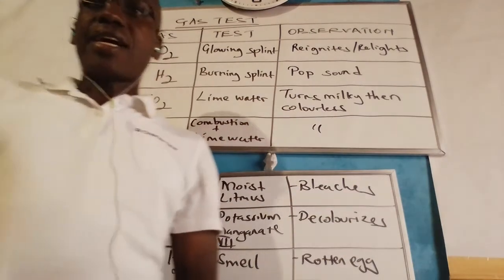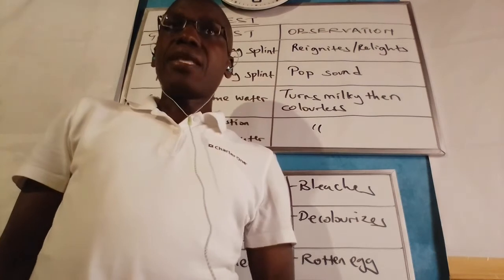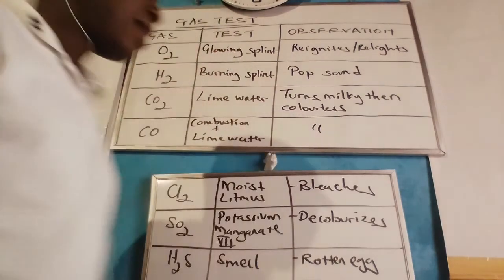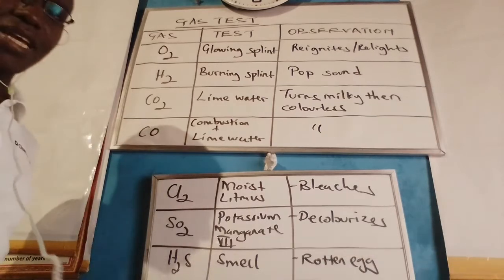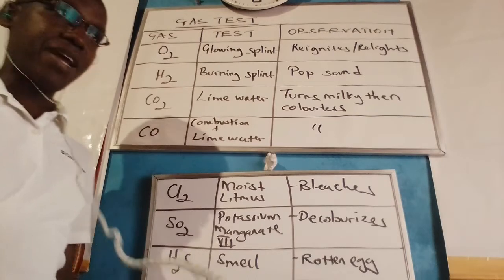Remember that hydrogen gas burns with a blue flame in a vacuum. However, in open air, it burns with a colorless flame and yields a pop sound because of the presence of oxygen, which it reacts with explosively. Next, we have carbon dioxide. Carbon dioxide is normally tested by lime water, and lime water in this case is calcium hydroxide.